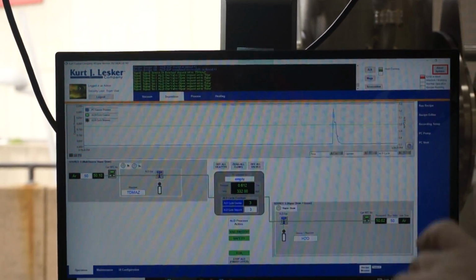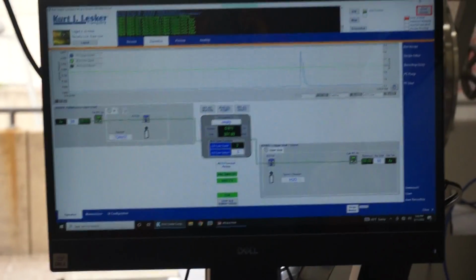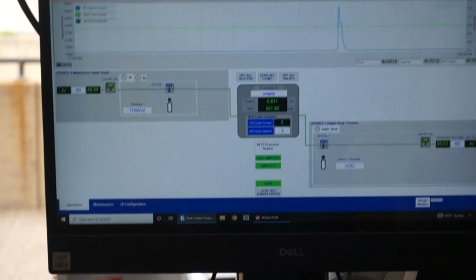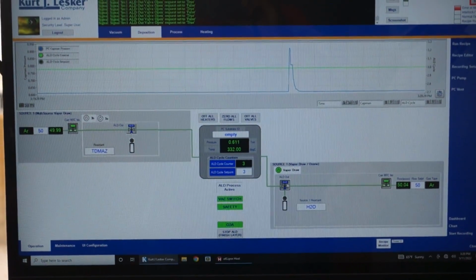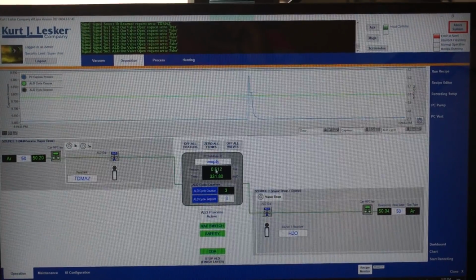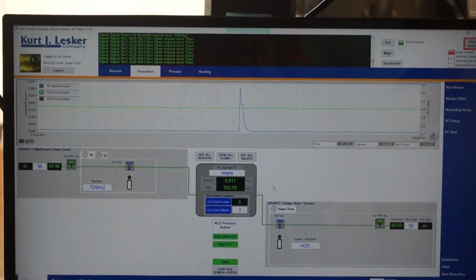The first time you could see a peak. If there was atmosphere, the atmosphere got pumped out. Then I do this 3 times with the gas flow, with the higher pressure. On and off. On and off. On and off.